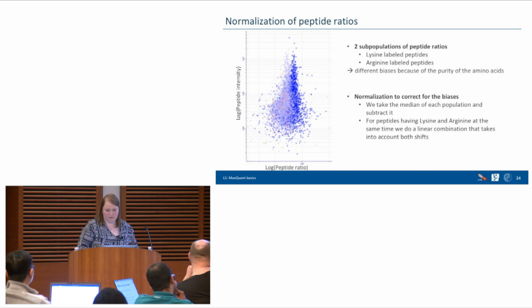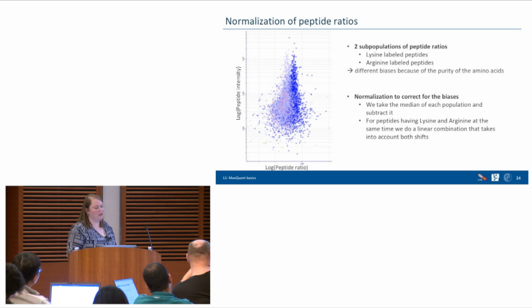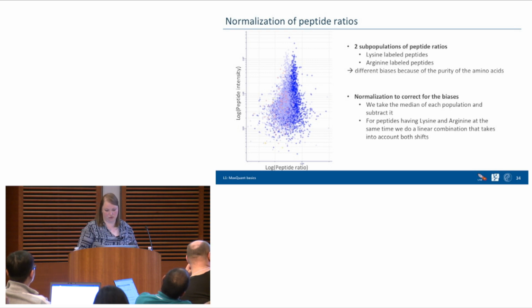But one has to say that if you want to know the ratio exactly, you should be careful with that option, because it underestimates the ratio, and then you get different ratio values. This method just tells you, if you're interested in the outlier ratios, so very extreme ratios, you can do this. But if you really need the exact ratio values, then you probably should not use that.